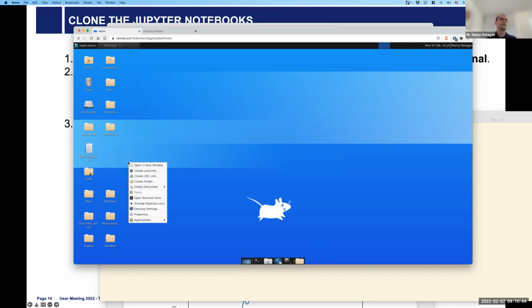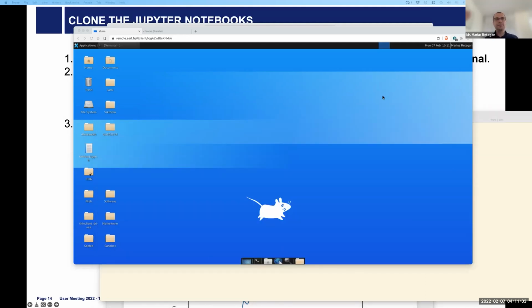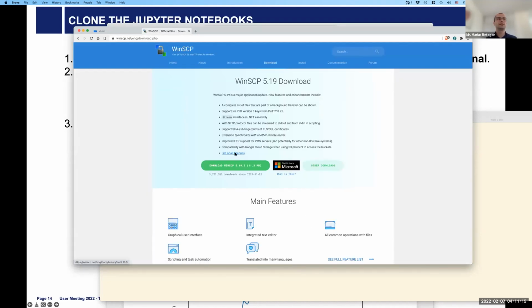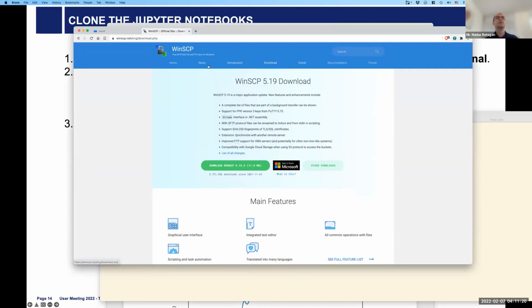And maybe explain why the question, because, for example, if we want to use reference data which we have had for years, maybe. Yes, this is the way to copy it. I assume you're on Windows, so there is something like WinSCP, which gives you a graphical user interface. I'm not on Windows, so I cannot really show you, and I don't have any. But that's all fine.